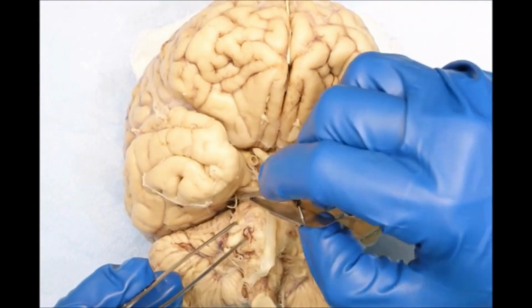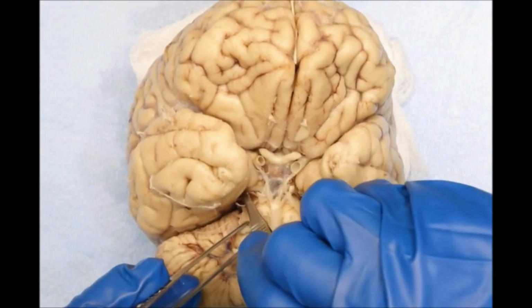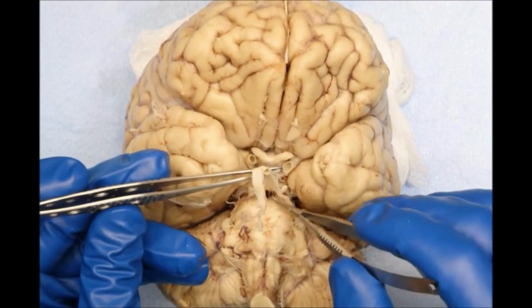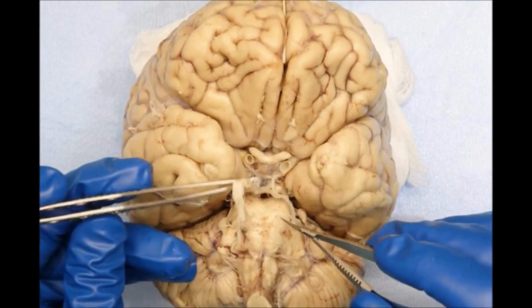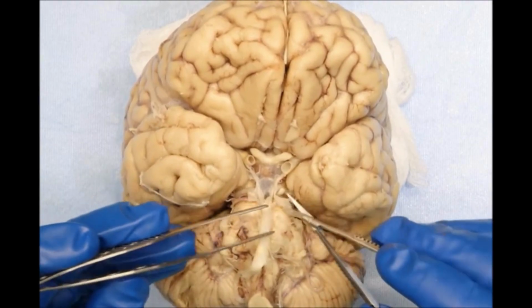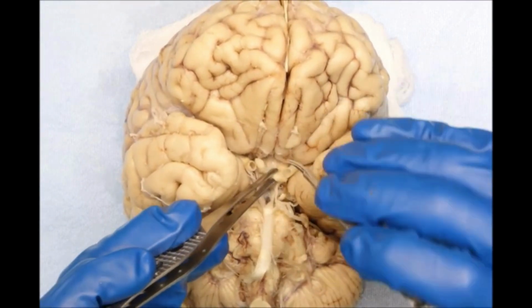I really want to try to keep the circle of Willis intact. So I'm giving a little bit of traction by grabbing onto the basilar artery. This is a tedious process and you kind of have to take your time.